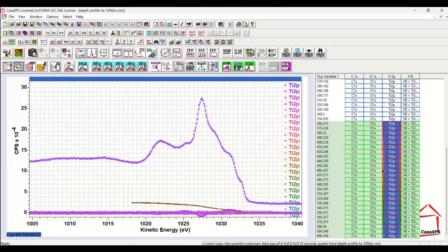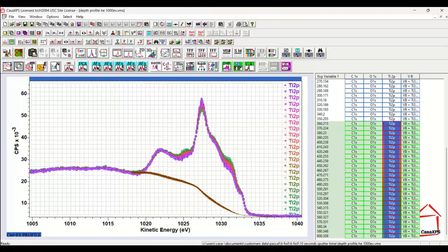So here I have this selection, the abstract factors. All I have to do now is press the predict using two abstract factors on the toolbar, and I produce a set of spectra that have signal enhanced relative to noise. This then is in a position where I could perform different analyses and try to understand what shapes lie within the data that I've now selected.